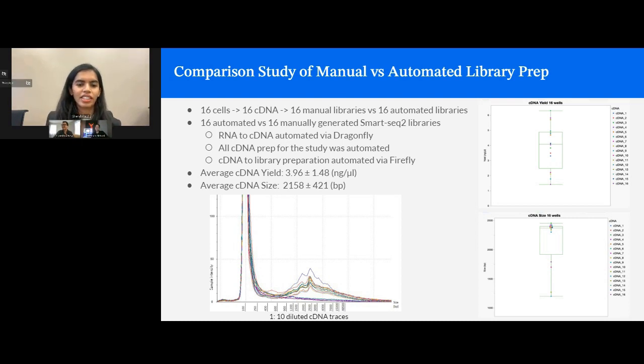Okay. At least to answer on how we have done our cell sorting, we have used the FACS instrument. I don't know if that's something that you have already tried, but if you want to use the FACS instrument, there's also the 10x, but that might be much more high throughput than what you're looking for. So maybe the FACS might be the way to go.